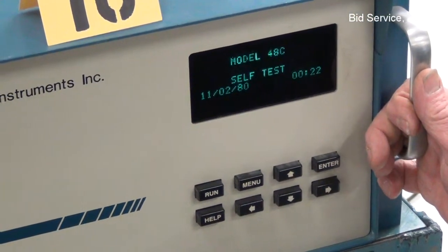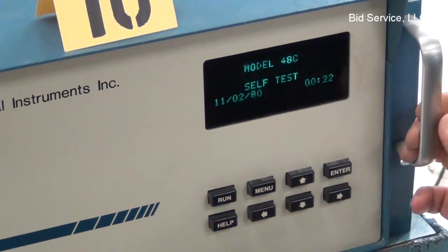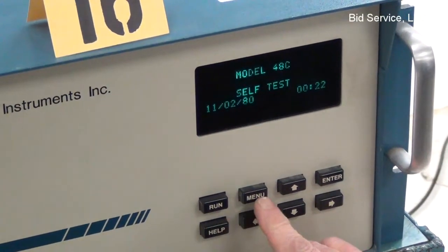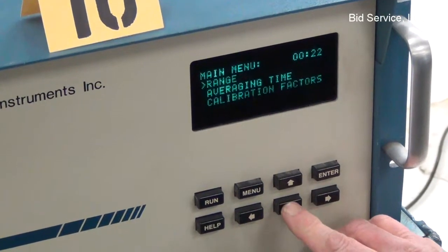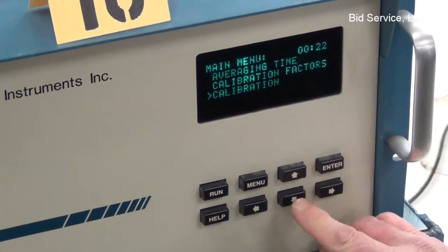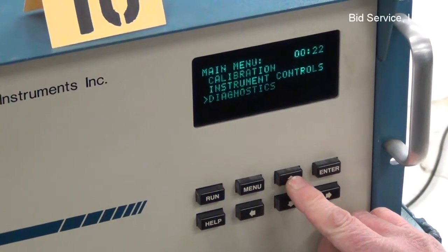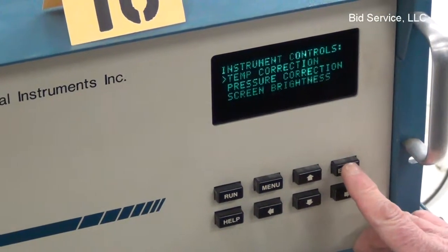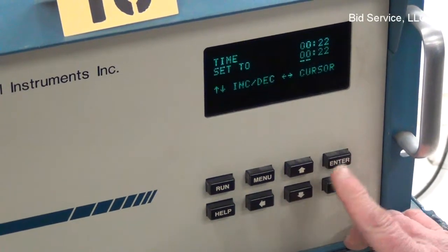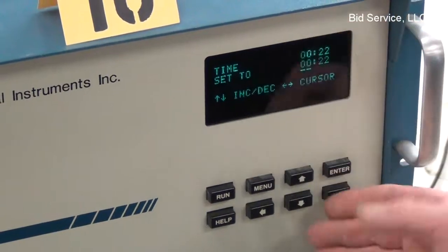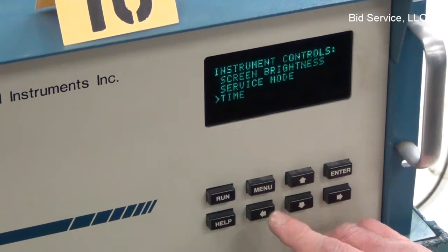The setup, calibration, and usage is very simple. The menu mode allows you to scroll down through all of the parameters that you might have to set. For example, if you wanted to set time and date, you could easily go into these menus and increment up and down. All the parameters are easy to set up in that way.